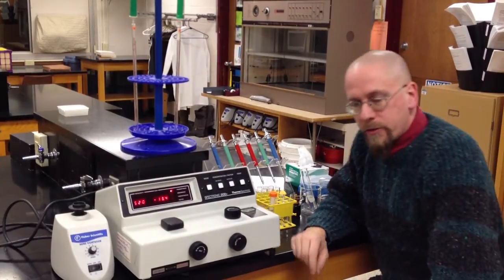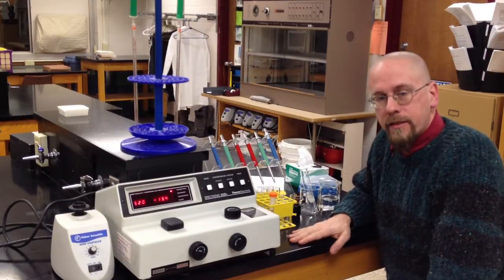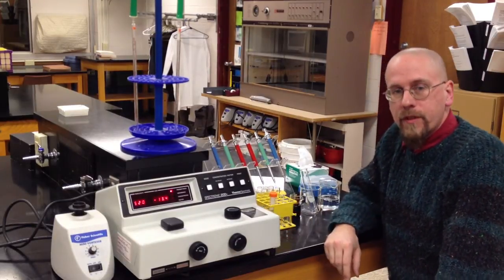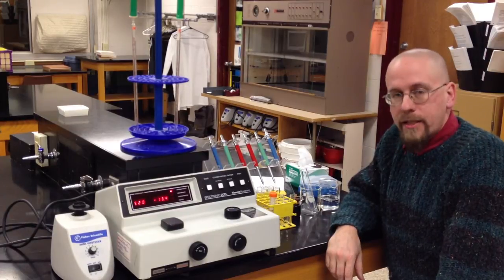Hello. What I'm going to do in this video is introduce you to the techniques and instrumentation that we'll be using in our series of labs where we investigate enzyme activity.